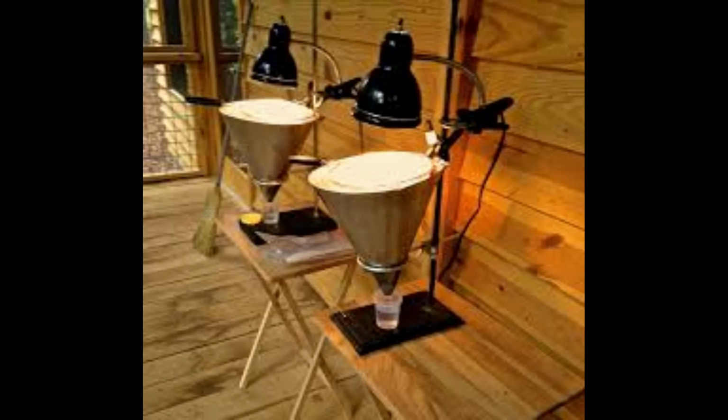Next, what you are seeing on the screen is a method used to collect spiders living in the litter and dried leaves. For this, we mainly use an apparatus called Berlese funnel. You can see the features of the Berlese funnel on the screen. We collect the leaves from the bottom of the trees in a large sack and bring it to the lab. Then we put the litter into the funnel at the bottom of the apparatus. There is a lamp, usually a 90 watt lamp, at the top of the funnel.